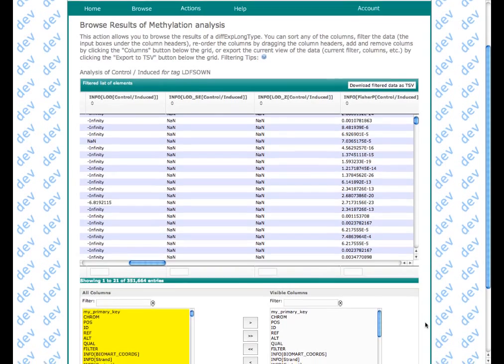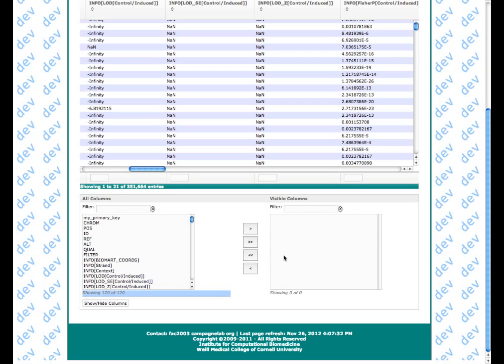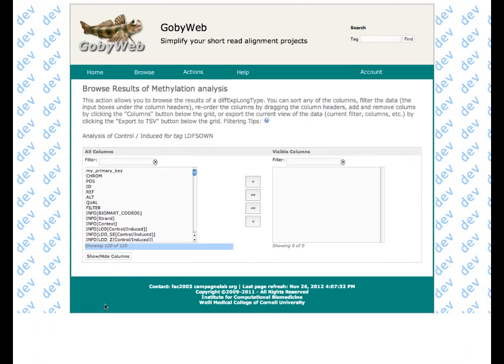So below the main table, you have this menu, all columns and visible columns. So all in all, this table is 120 columns, but this subset view is only showing 30 of those. So you can either remove all the columns, so you move the visible columns into the all columns side and click show or hide. So then I can build my table dynamically using the fields that I would like. So I'll set up the table.